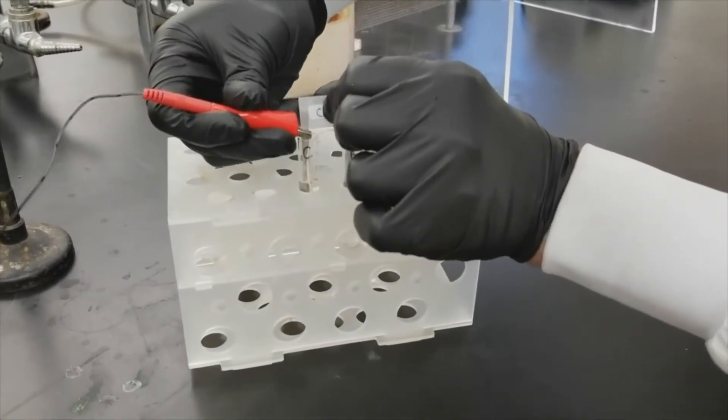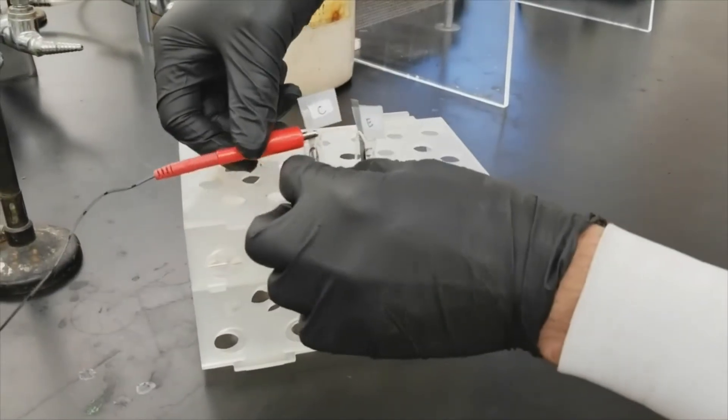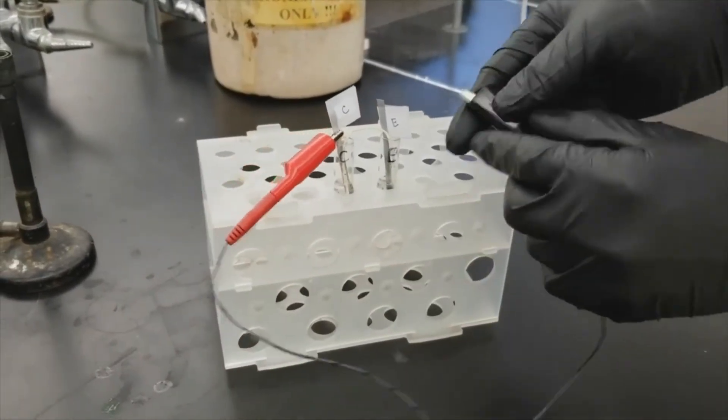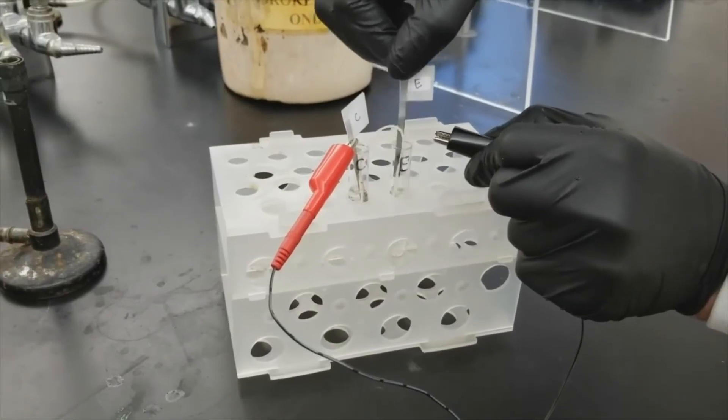Then place the clamps onto the metal electrodes. Remember the red clamp attaches to the cathode and the black clamp attaches to the anode.